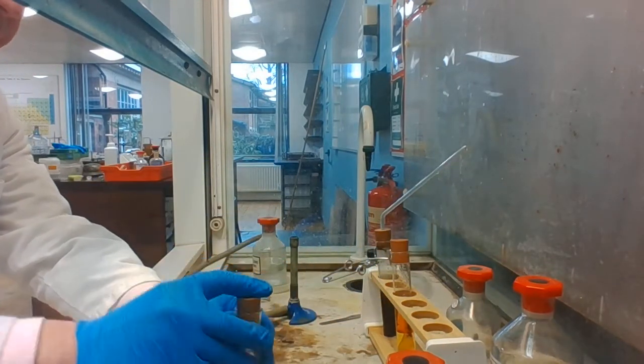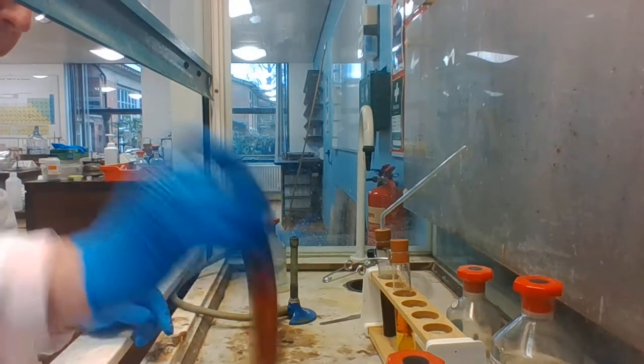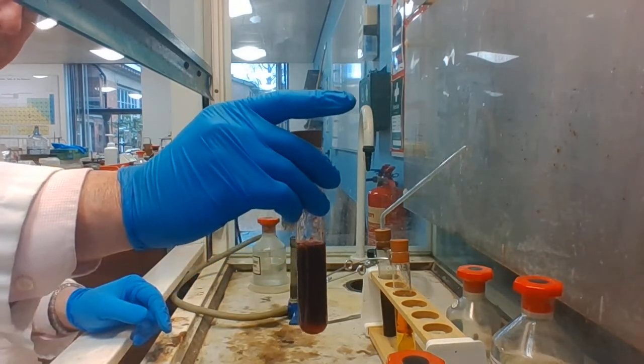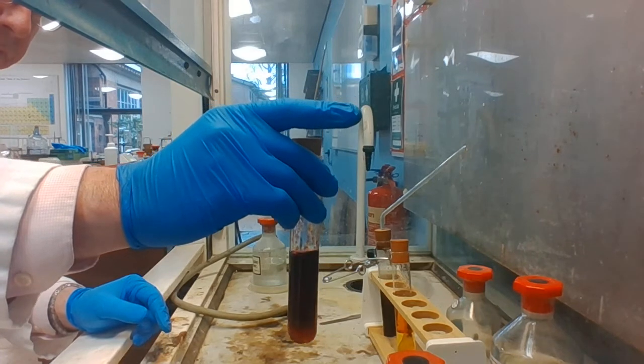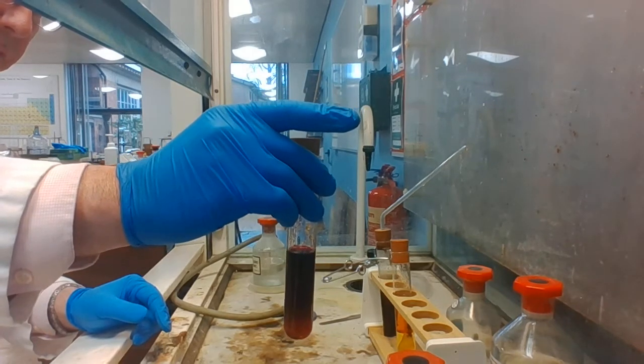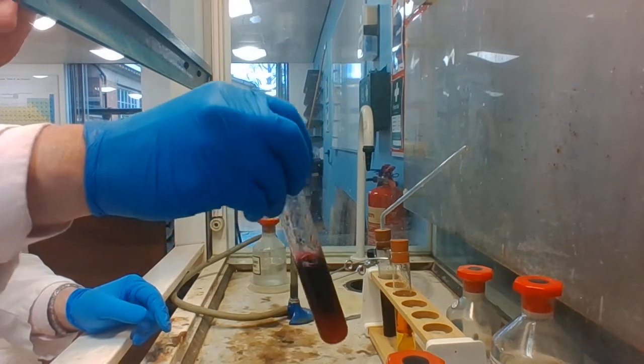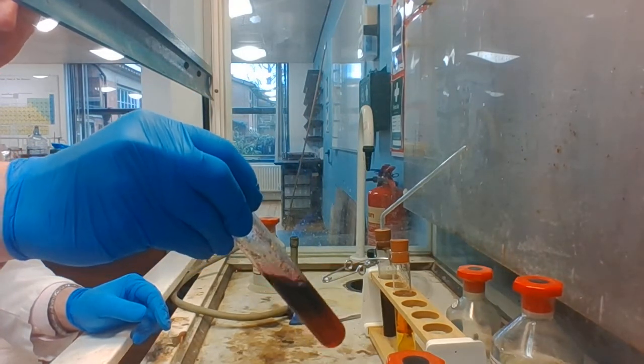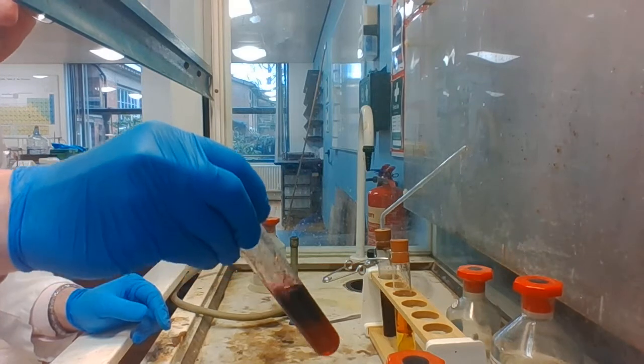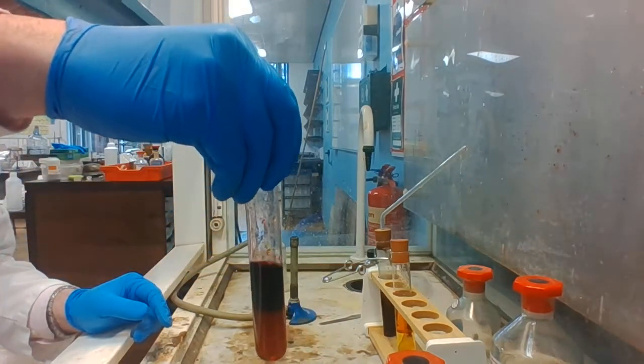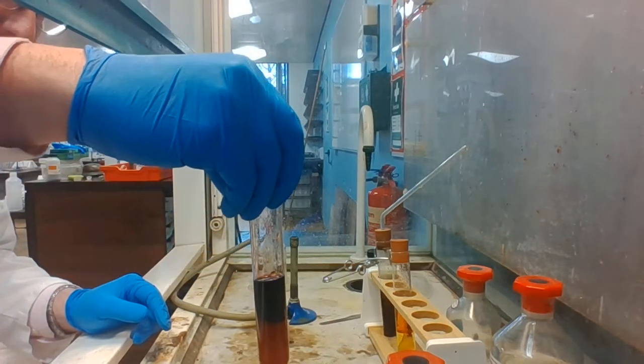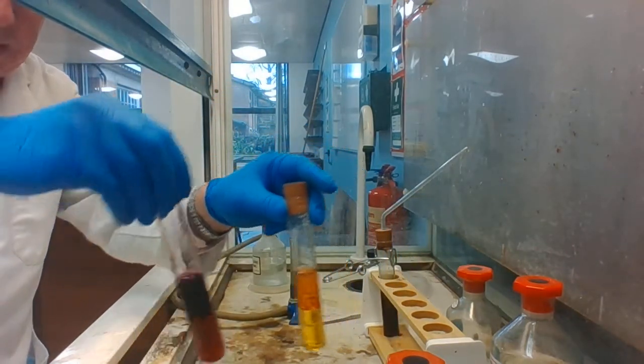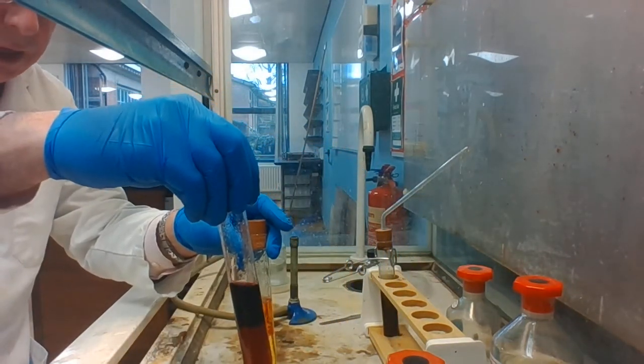If we do the same with the potassium iodide and let it settle, again you might be able to see that we have a purple color at the top there. That purple color indicates that iodine has been produced in this reaction. So the chlorine has displaced bromine from bromides and iodine from iodides.